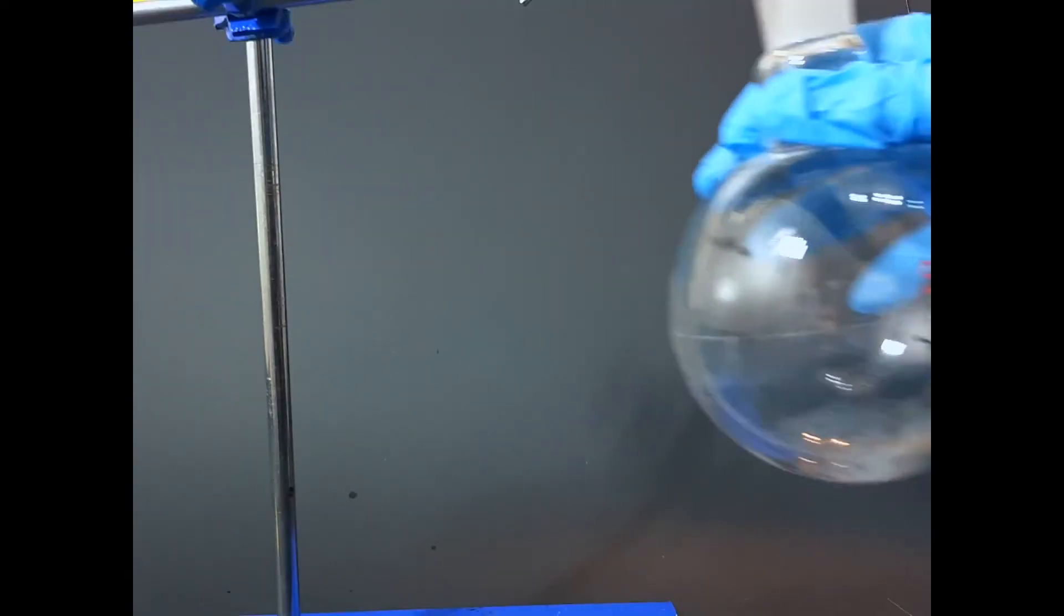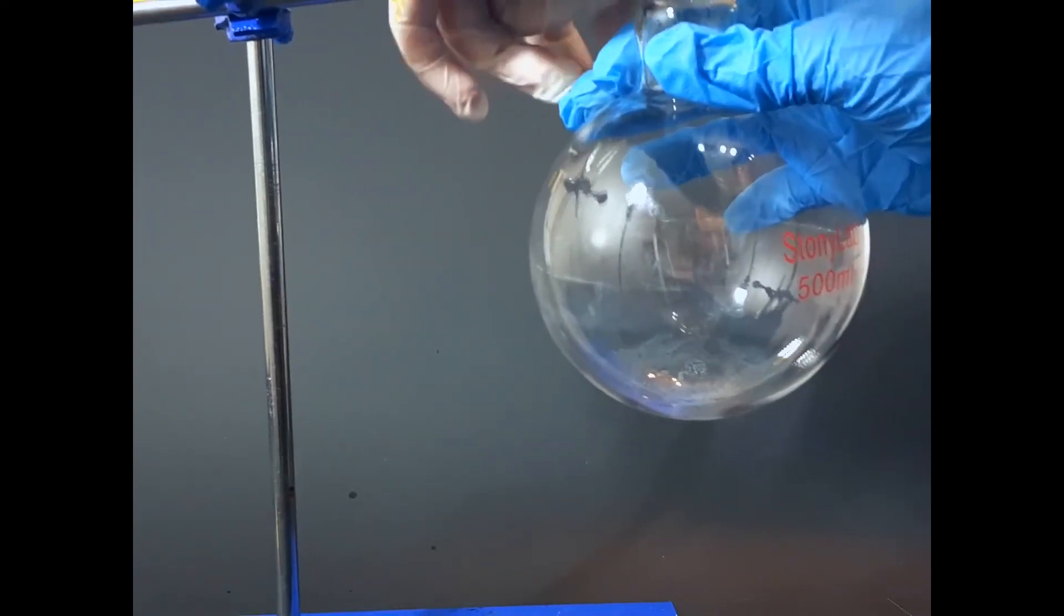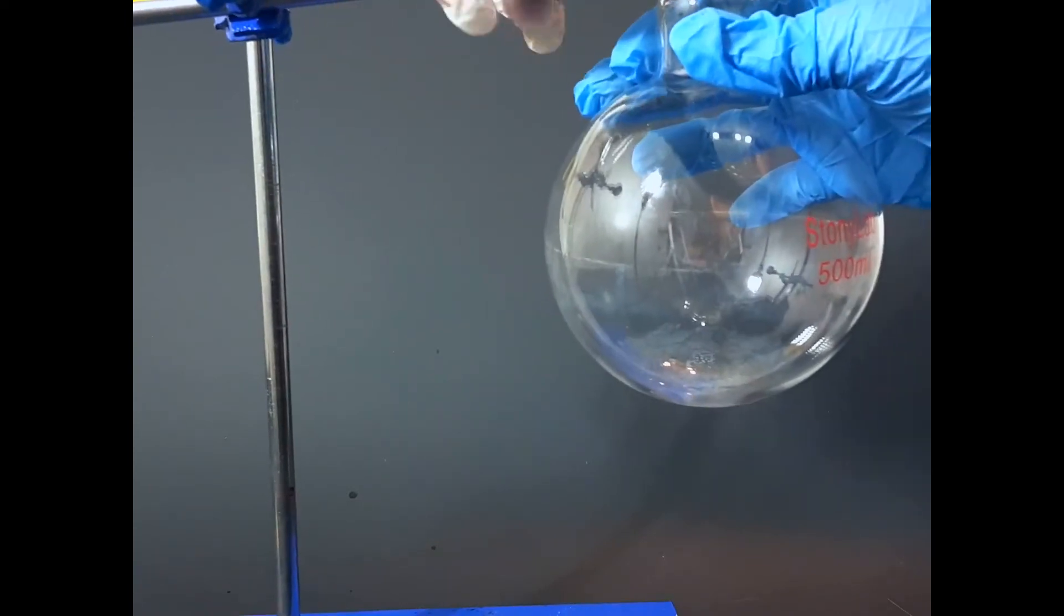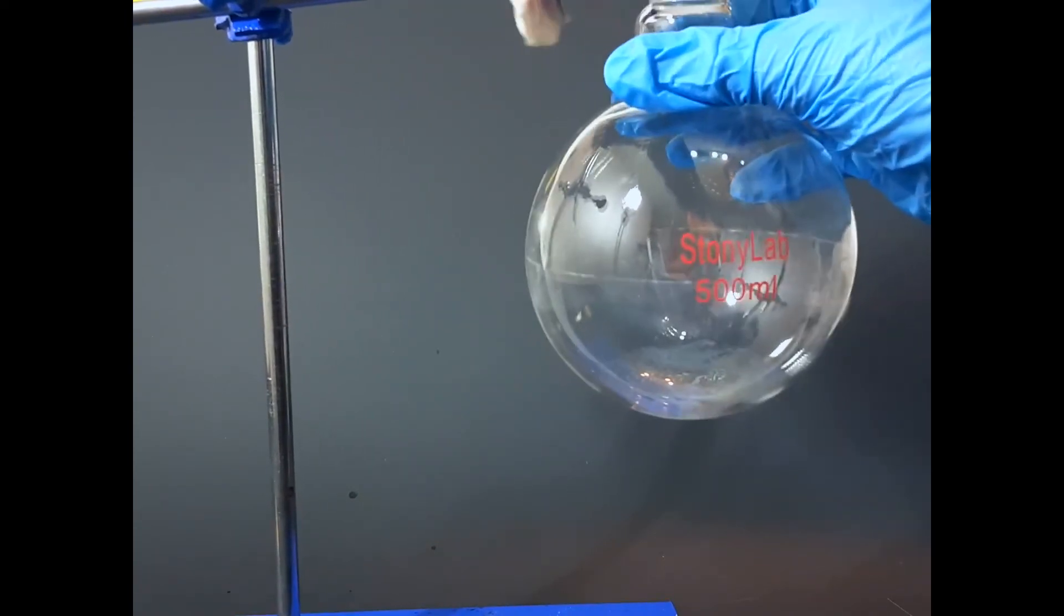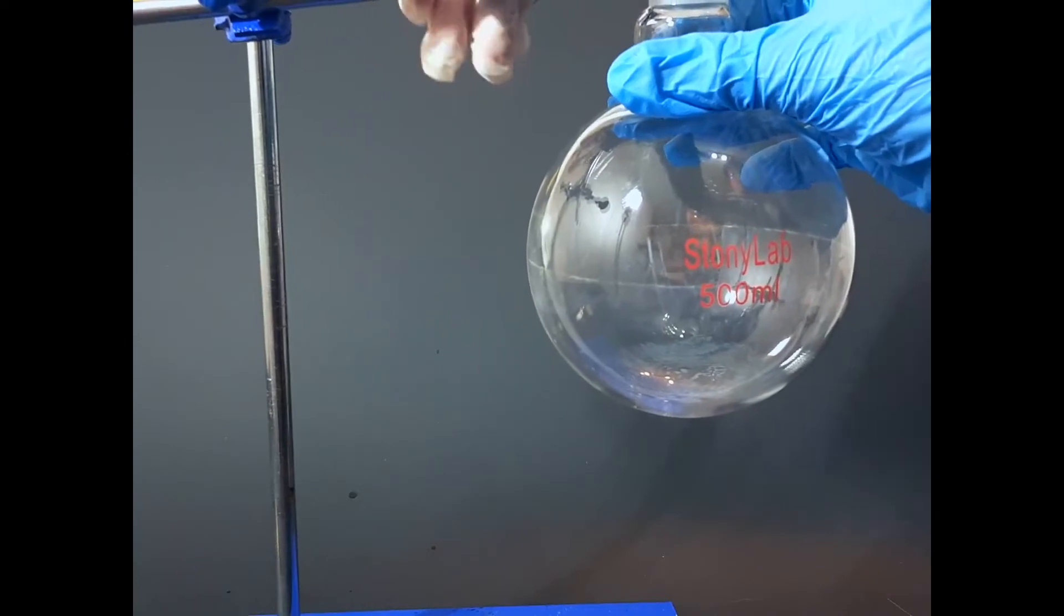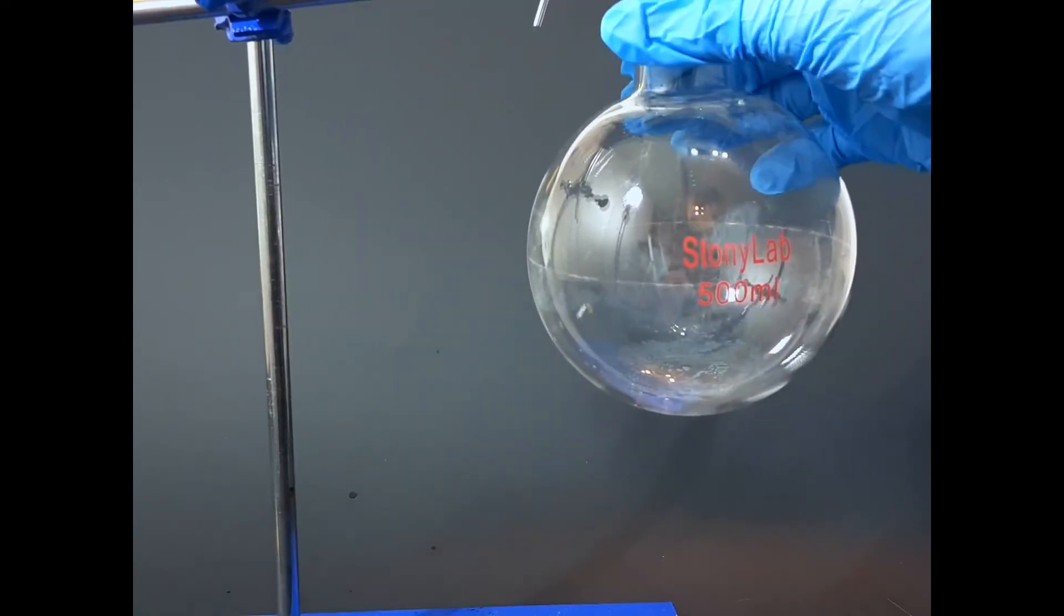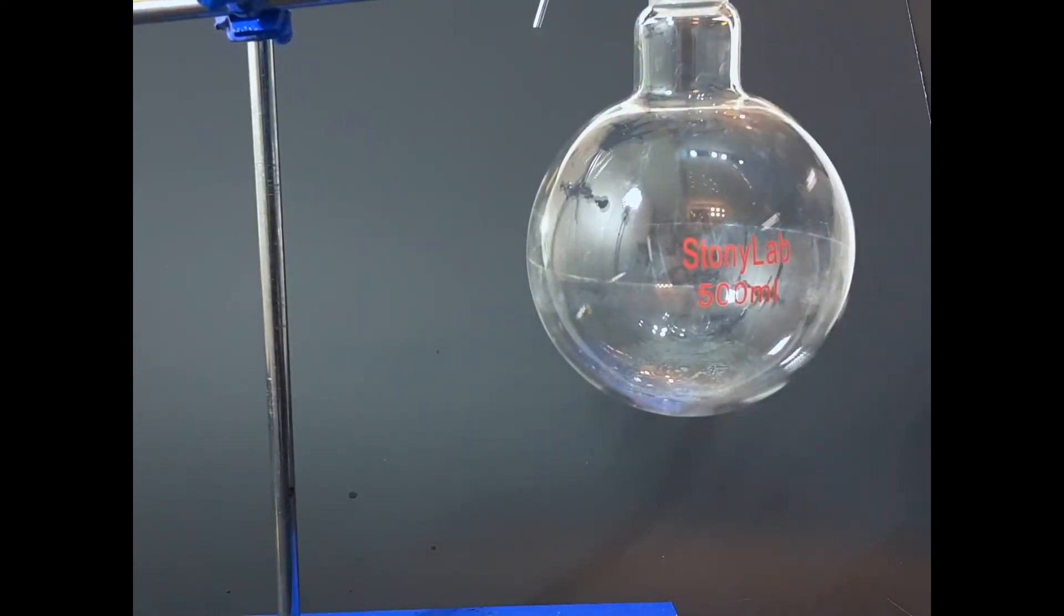Once I have everything nice and clear, all I need to do is pour it into a round bottom flask. As you can see here in my sand bath, I'm putting a round bottom flask and we're going to heat it up to make sure that all the DCM is gone so the caffeine can crystallize.